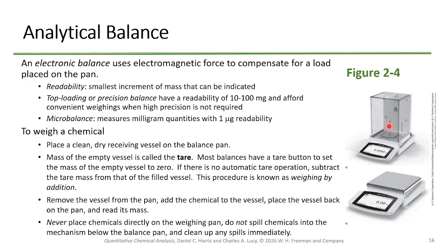What happens to anything you touch? Oil, right? Your fingerprints get left. Okay? If you're using an analytical balance, then your fingerprints are going to be weighable. Right? They're actually going to affect that. You will see it. Okay. Whenever you're taking a measurement, including the taring measurement, you need to close the windows, make sure the little bubble is lined up and nobody's moved it.